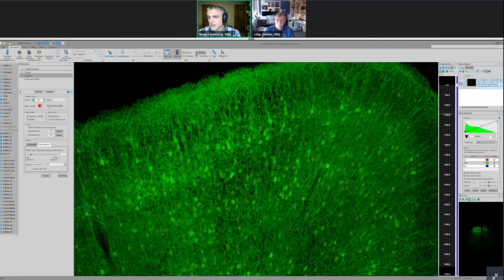And then on top of that, there's the training of the neural network, where we're adjusting those millions of parameters to try to get the best division between objects that will be classified as cells and objects that are classified as not cells. So Brian, you might want to describe how the training is done. Sure. Using this example, the first thing is it goes through and does it just with the cell strength, and then a human, oftentimes me, yes, our expert human, goes through and looks at each of the things that have been detected and says, is that a neuron or isn't it a neuron? Go ahead.